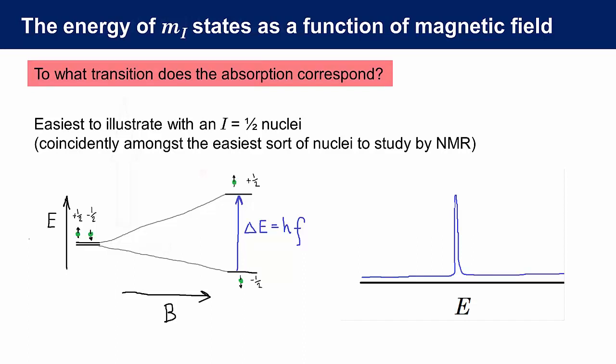For a more modern explanation of current NMR spectrometers, we should talk about Larmor precession frequencies and free induction decay and pulse sequences, but today I'm going to stick with the older type of description because it's clear and easily understandable. If the excitation energy just depended upon the nature of the nucleus and the size of the applied field, all nuclei of a particular isotope would absorb at the same energy. NMR would not be a useful tool for characterization. Fortunately, there's one little caveat that's very important.